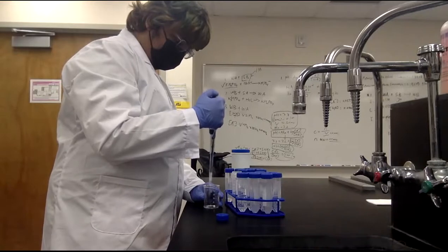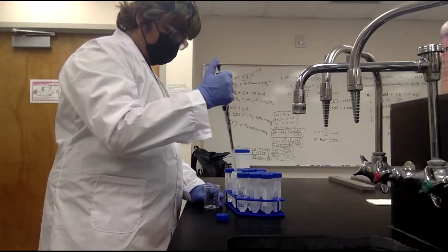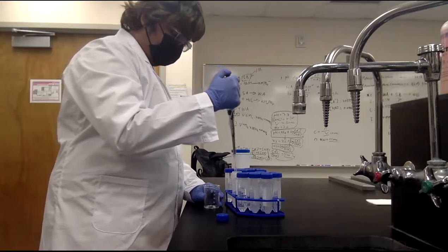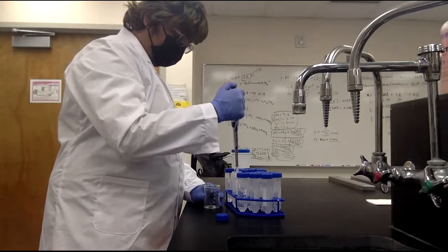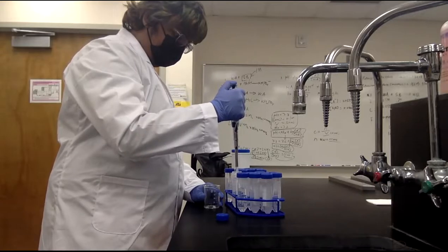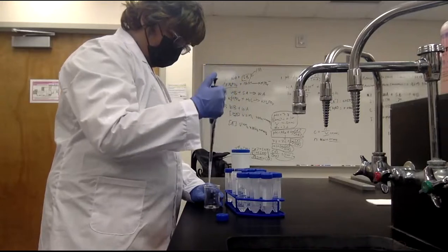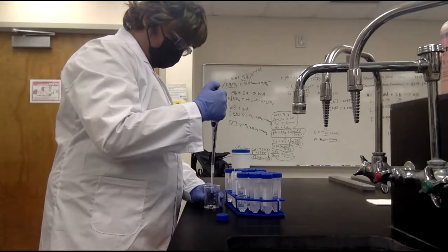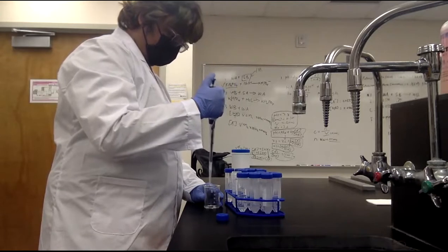Okay. But don't go too deep. Just make sure the tip is beyond the solution, that's fine. You don't need to push your pipette to the very bottom.